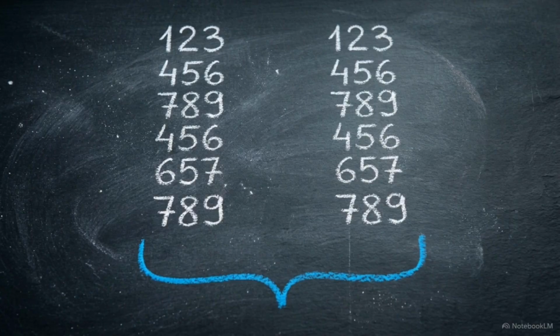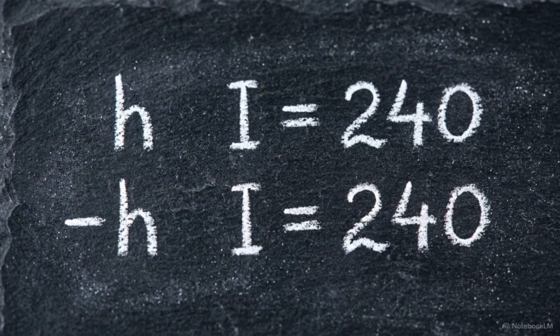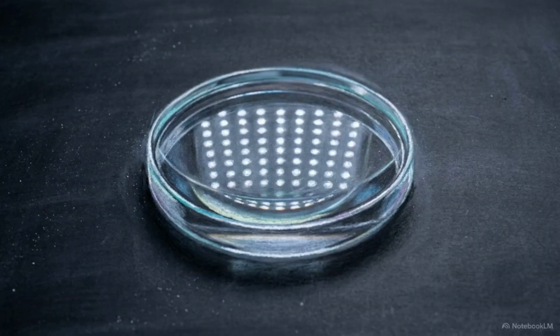To solve for the missing phases, we need distinct variables. Because Friedel pairs yield perfectly equal amplitudes, we have no comparative leverage to calculate the difference. Building a more sensitive detector does not fix a symmetry inherent to the diffraction geometry.